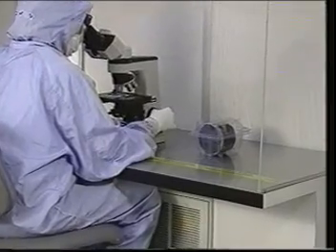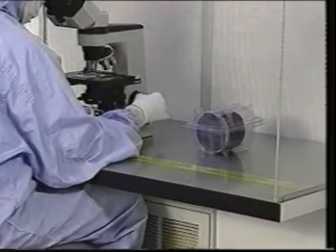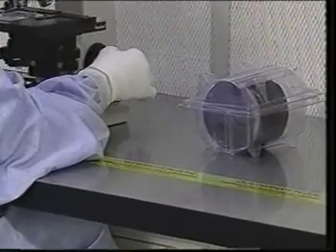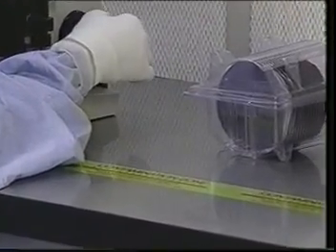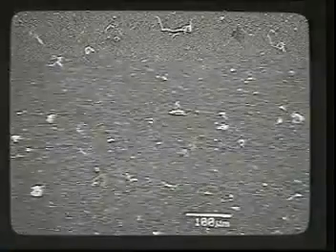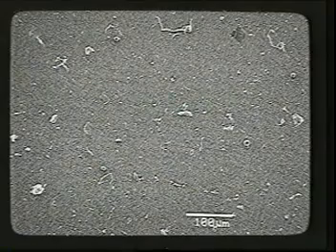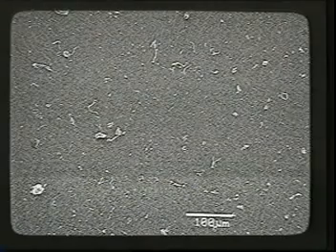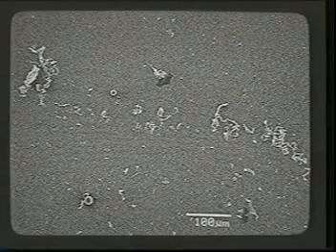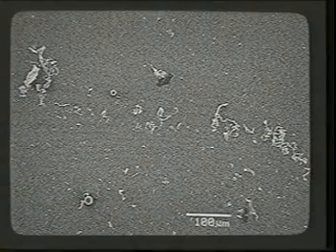Take a look at this surface. The average person would consider it clean, because to the naked eye, that's exactly how it appears. But is it clean? A closer look under extreme magnification reveals something that might otherwise be overlooked: numerous particulates and contaminants scattered across this tiny region within our view. Imagine the amount of contamination present on the entire surface.